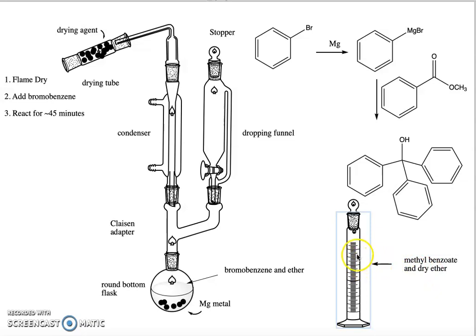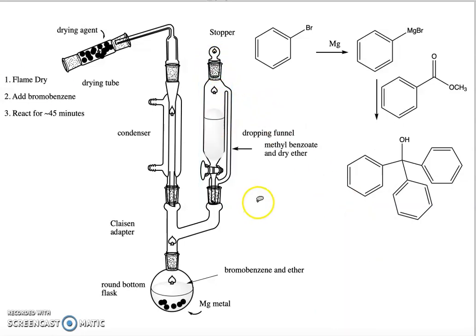We're going to take that and as quickly and as dryly as possible without exposing it to air for very long, remove this stopper and this stopper, and transfer the methyl benzoate and ether to the dropping funnel.